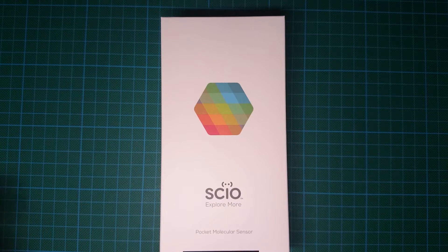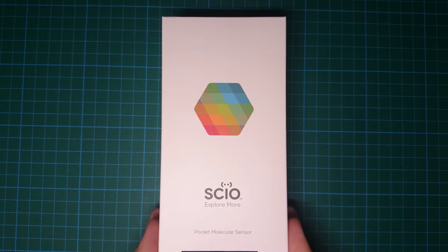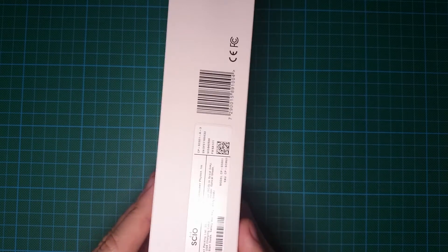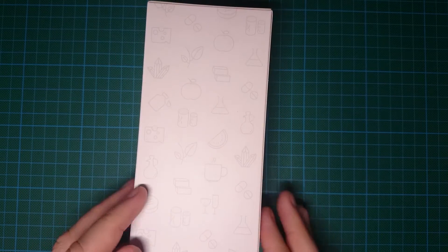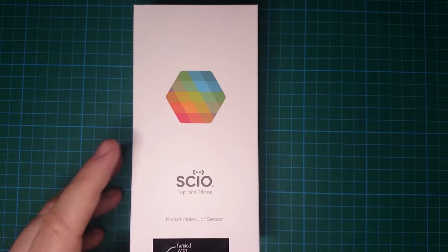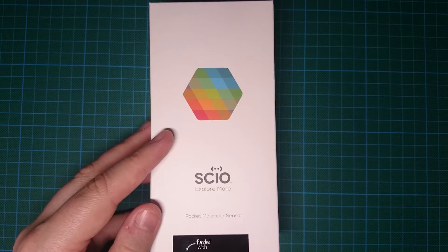Hello and welcome to this unboxing video for the SCiO Molecular Scanner. Just arrived in the post — I ordered mine on Kickstarter quite some time ago. It comes in a very nice looking professional box. So let's get this started.